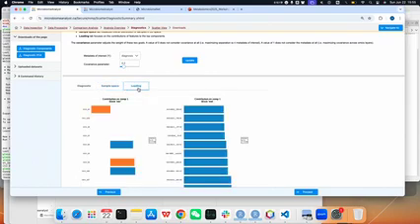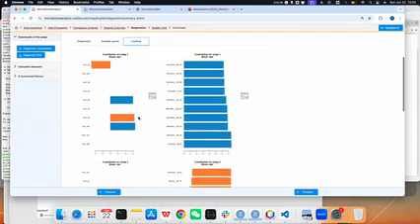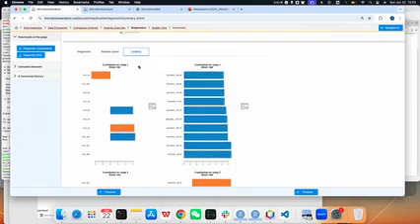And then the third is loading. So in this example, we can see the first component is more reliable. And this is a biomarker view, showing the selected top 10 significant features for either the microbiome data or the metabolomics data.